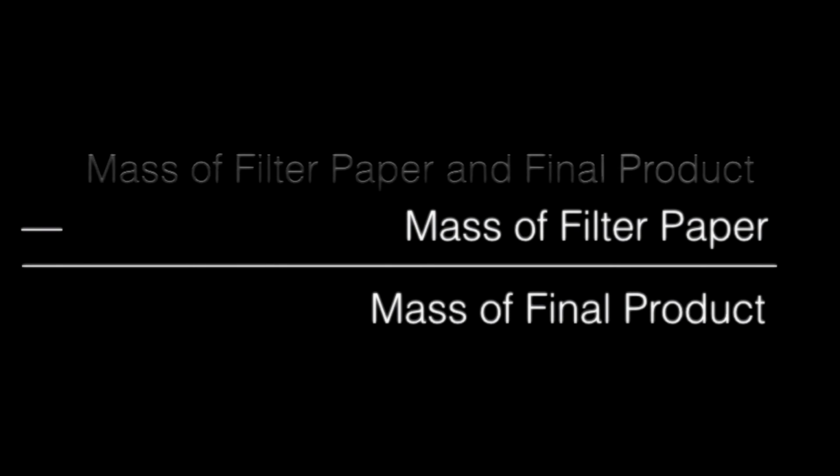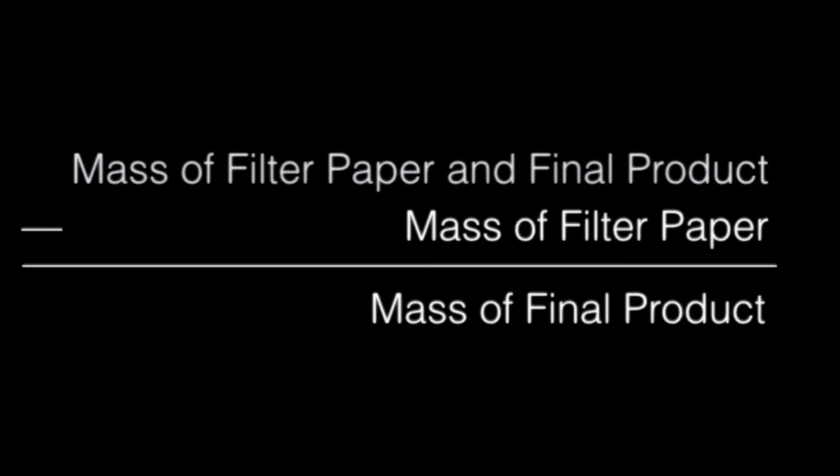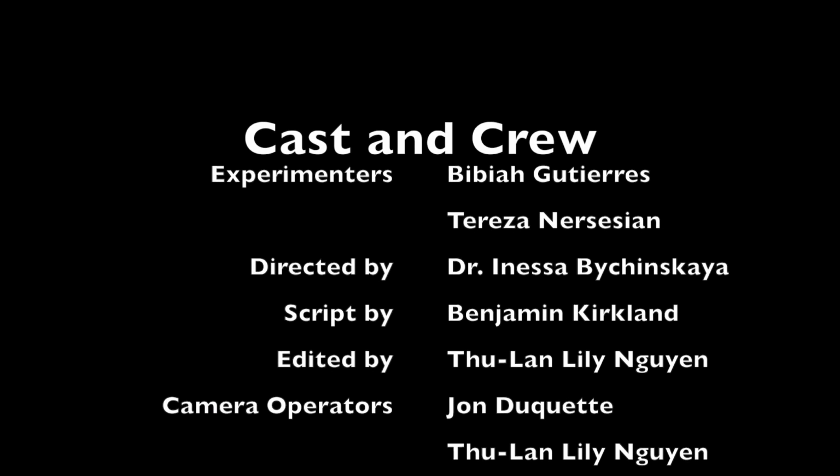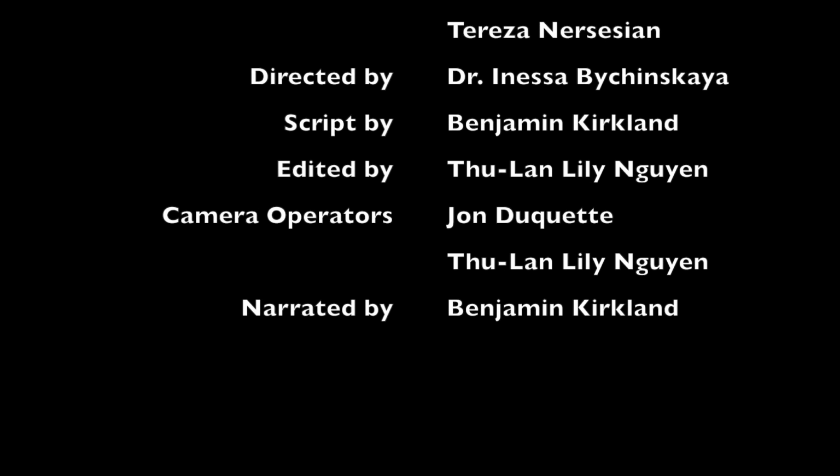To get the mass of your product, subtract the mass of the filter paper obtained earlier from the total weight. To determine the purity, you must take its melting point. The tutorial is available in a supplementary video.